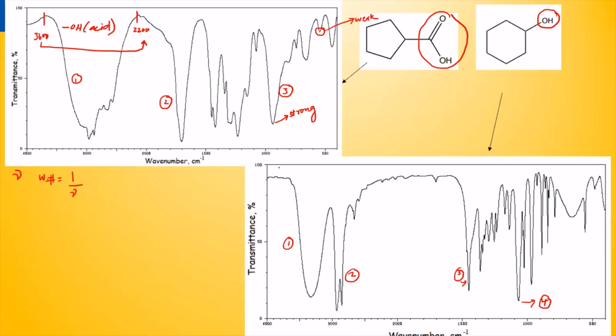If you draw a line, it doesn't have to be perfect, just approximate. It's around 3100 to about 3600, or 3500, it doesn't matter. I'm just rounding these values up, because no one's going to ask you to write these values down.